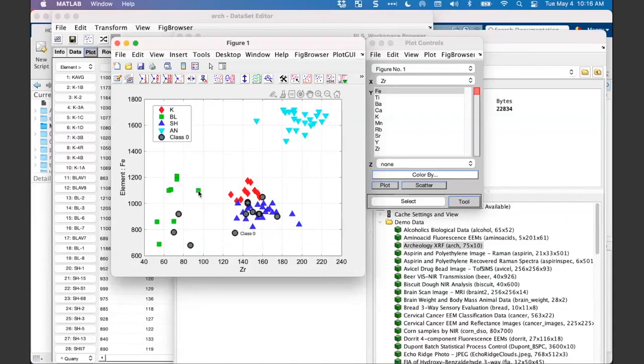Again, you can just select any class you want. And if by chance you don't want that highlight, just click again on the sample, and you can toggle it again. You can do it as many times as you want, but just remember that to get rid of that label and highlighting, you just have to click again on the sample.